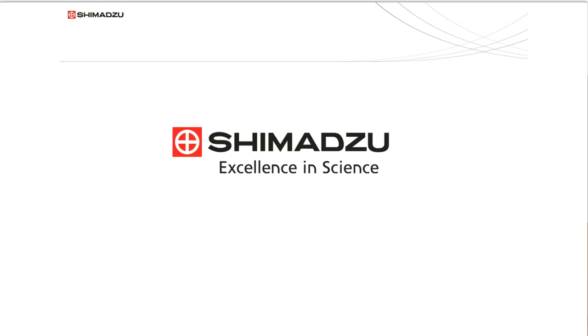Excellent. We have another question asking, are there packages to be able to use this type of screening system along with, say, triple quad mass spec detection on the back end?